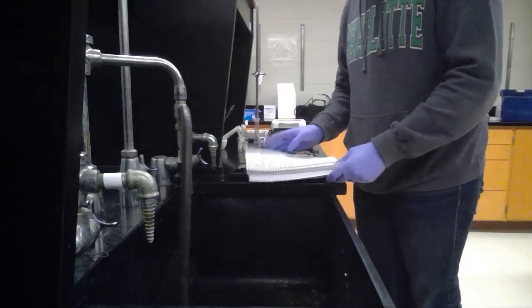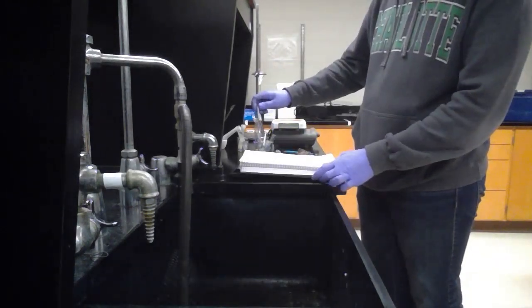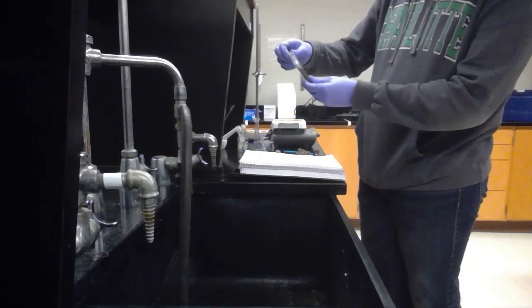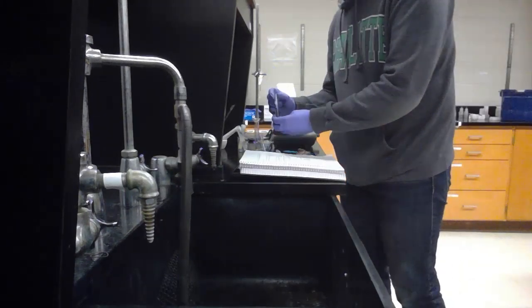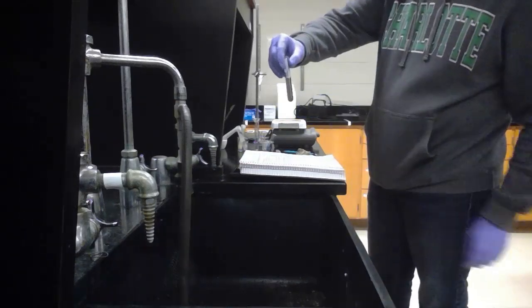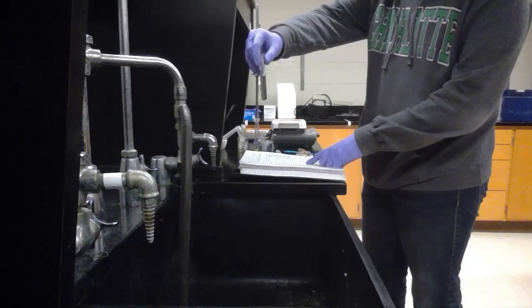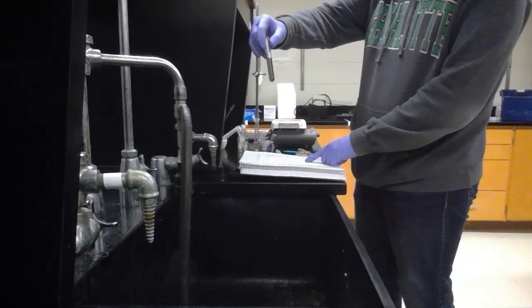After we got that data, for our potato chip extract, which I believe is this one, our absorbance at 595 was 0.925. And it's kind of like a gray color, so I wrote that.